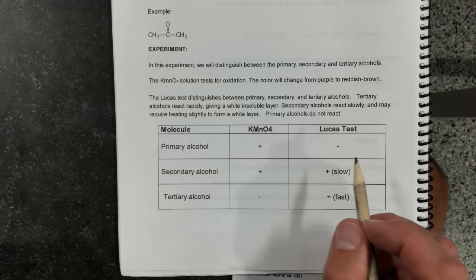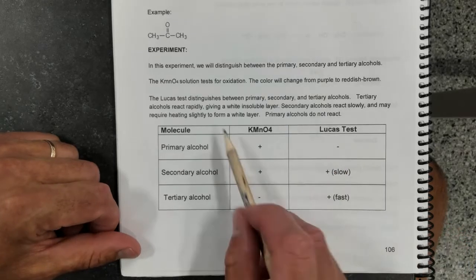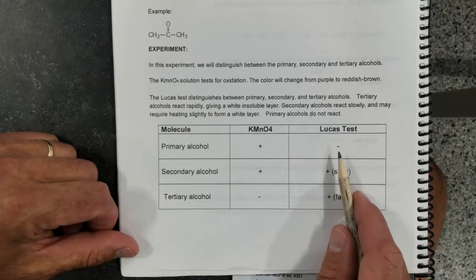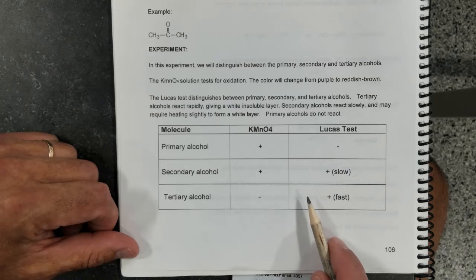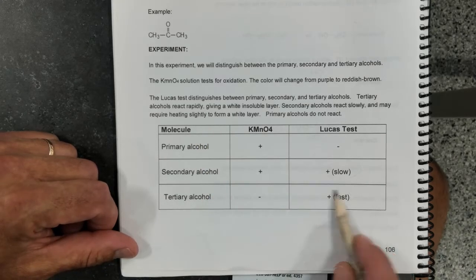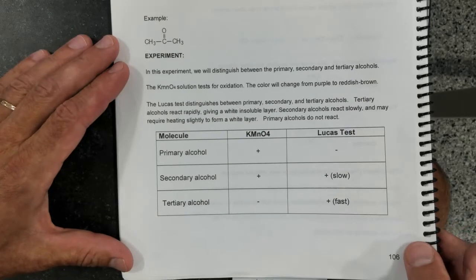The Lucas test distinguishes between primary, secondary, and tertiary alcohols by the formation of a white insoluble layer. Primary alcohols do not react in the Lucas test. Secondary alcohols react slowly and may require heating, while the tertiary alcohols react rapidly, giving a white insoluble layer.